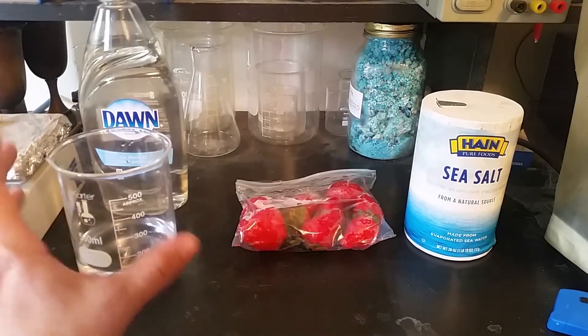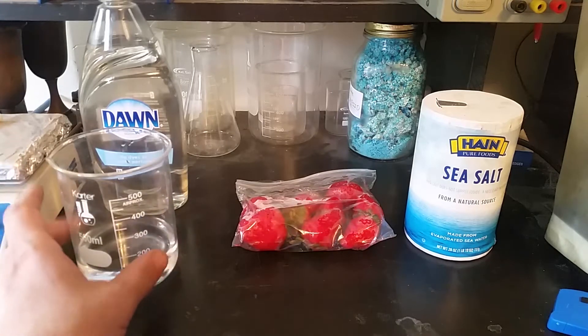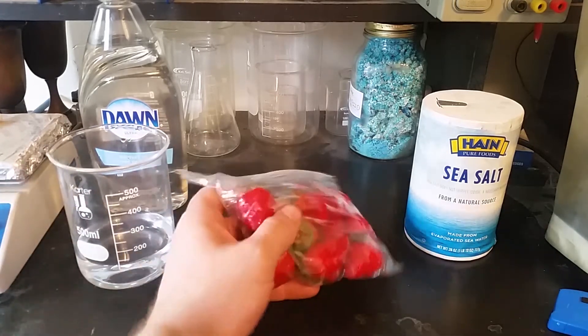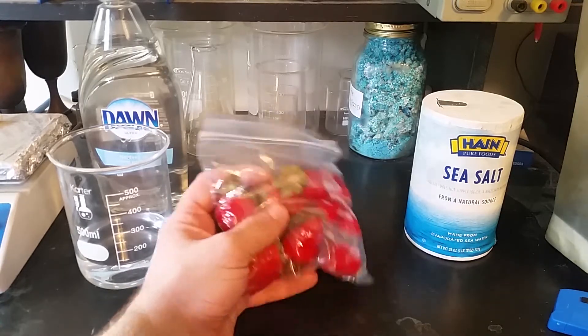Hey guys, so today we are going to be replicating an experiment done by another YouTuber, Niall Red. In one of his more recent videos, he had extracted DNA from strawberries, and then he decided to try it out, eat it, and see what it tasted like.